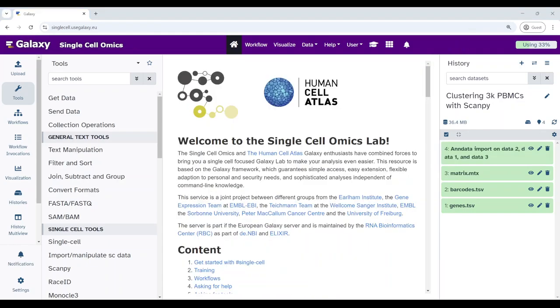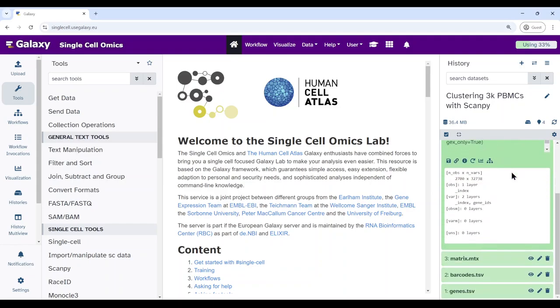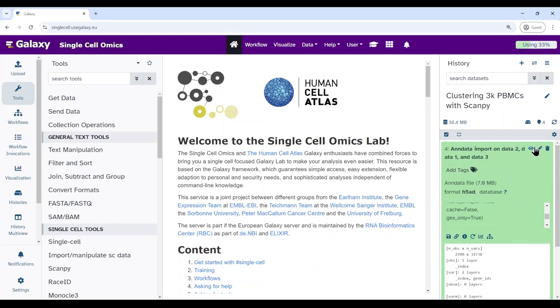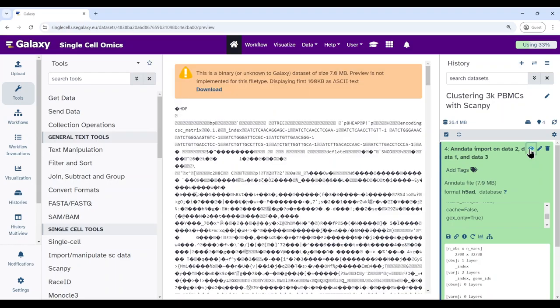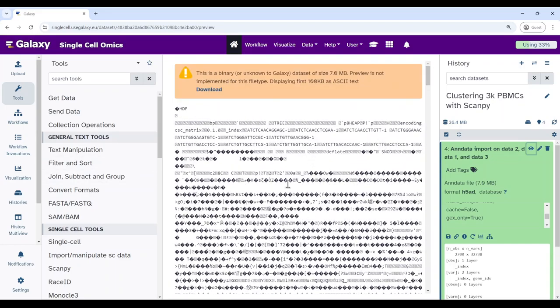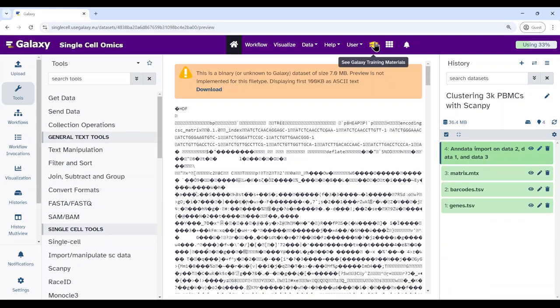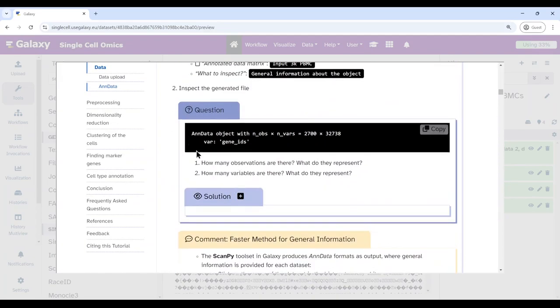The AnnData was created from the three files. AnnData is much smaller — it's 7 megabytes, whereas the input data was more than 25 megabytes. You can try to view it using the eye button, but it shows random stuff because it's a compressed binary format. To view the contents of this file, we have to run a tool called Inspect AnnData.